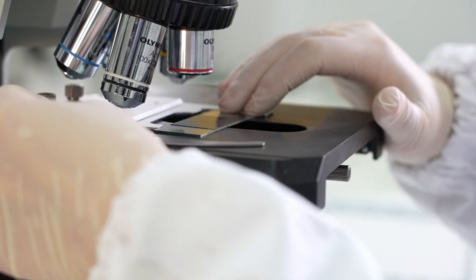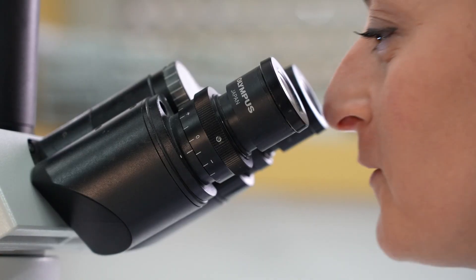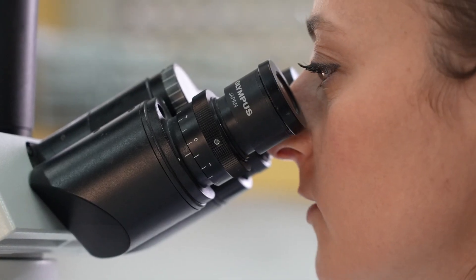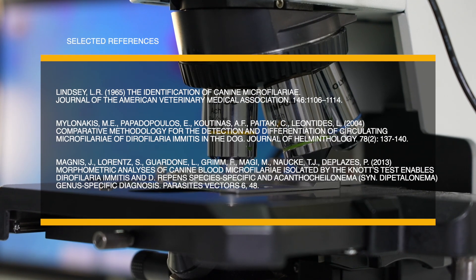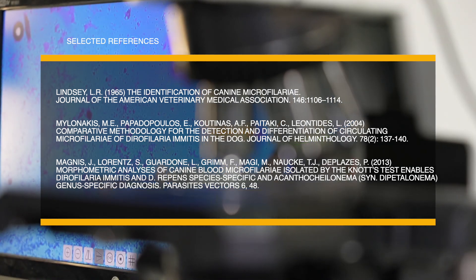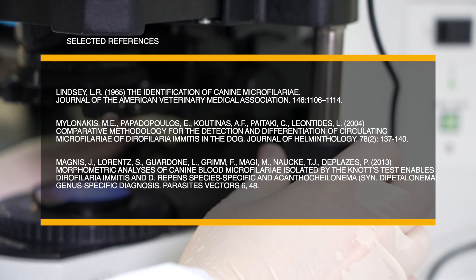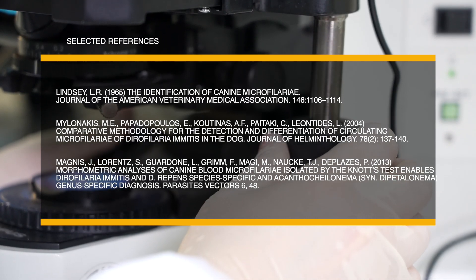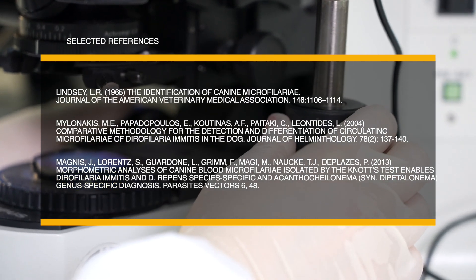If microfilaria are present, specific identification can be accomplished based on size, length and width, and morphological features of the anterior and posterior ends of the microfilaria. To see these features and obtain more precise measurements, 20x and 40x objectives are recommended.